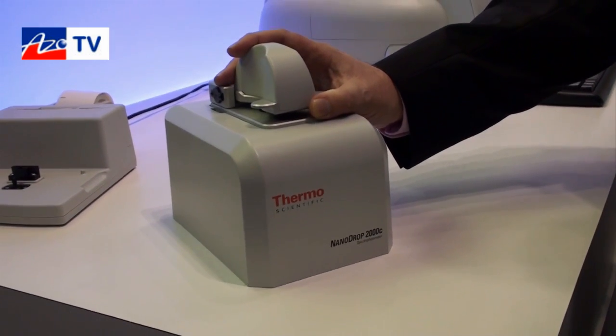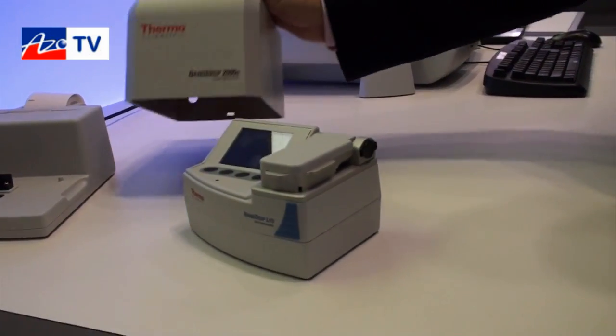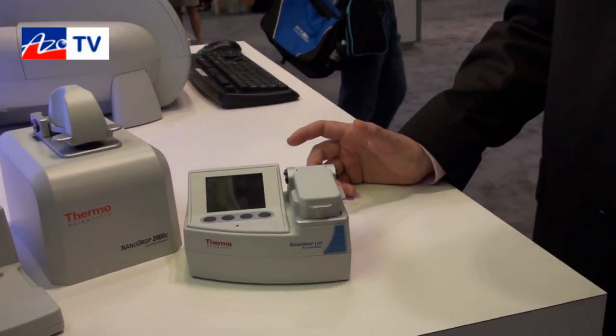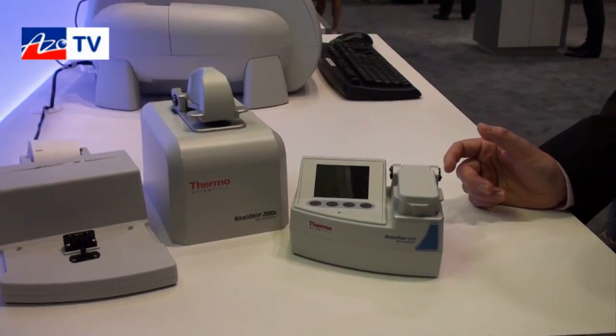At the show this year we're launching the latest member of the family, the new smaller NanoDrop Lite. This is very much a personalised version of the NanoDrop instrument, designed primarily for the quantification of nucleic acids.